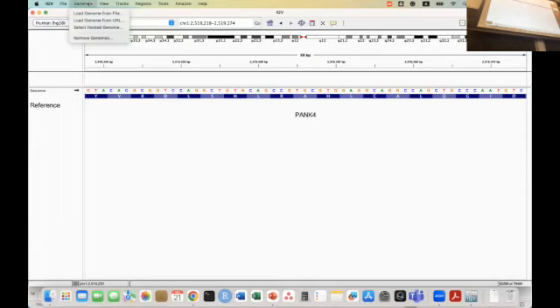We usually use a greater than sign followed by a name, let's just say CHR 30, chromosome 30.